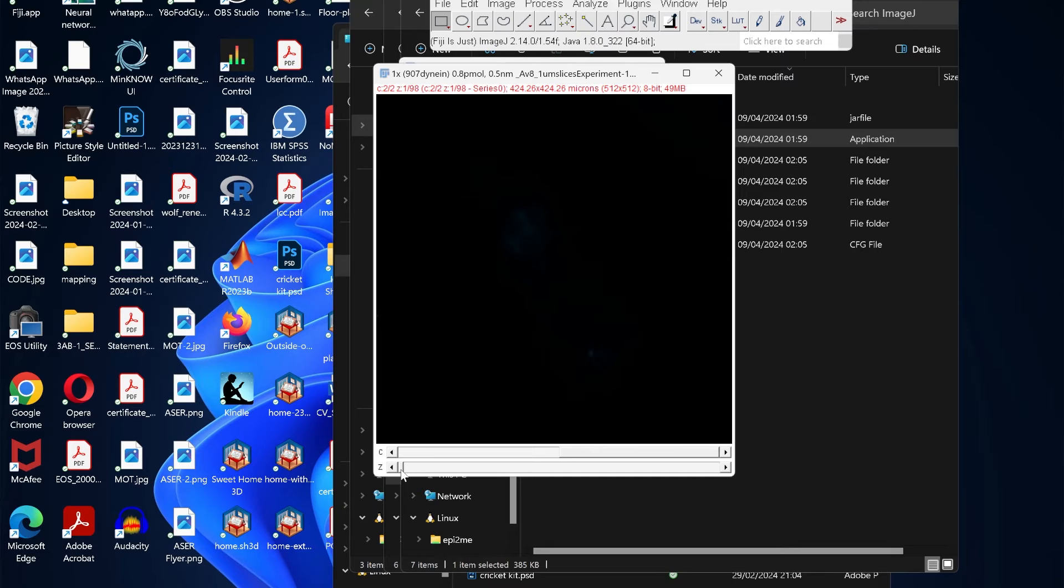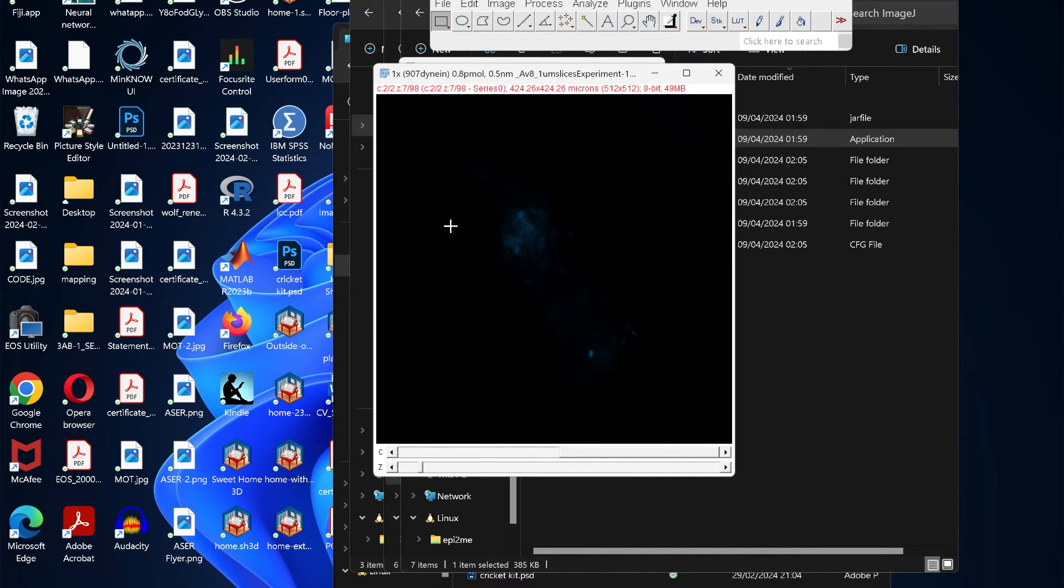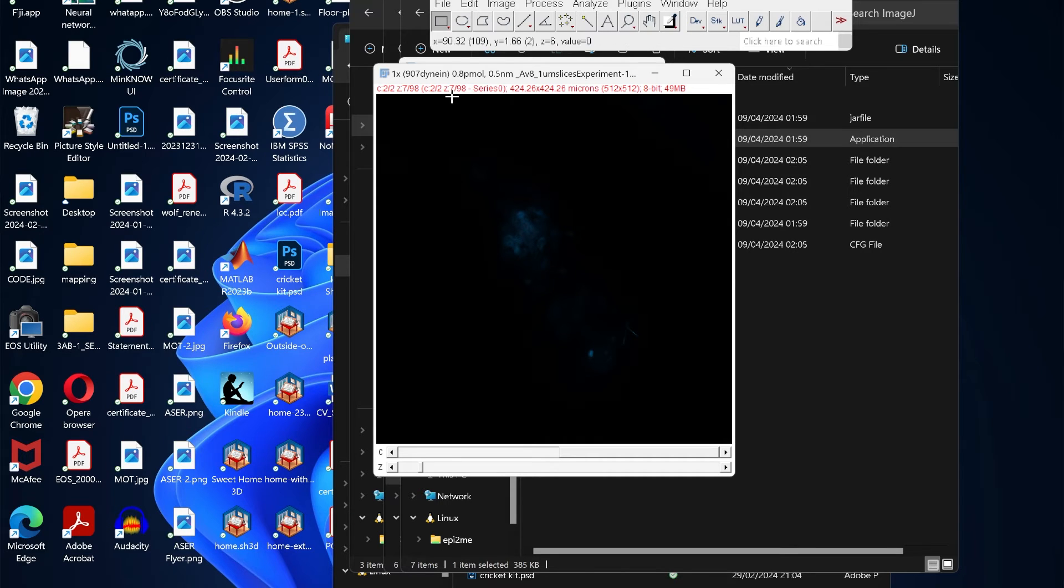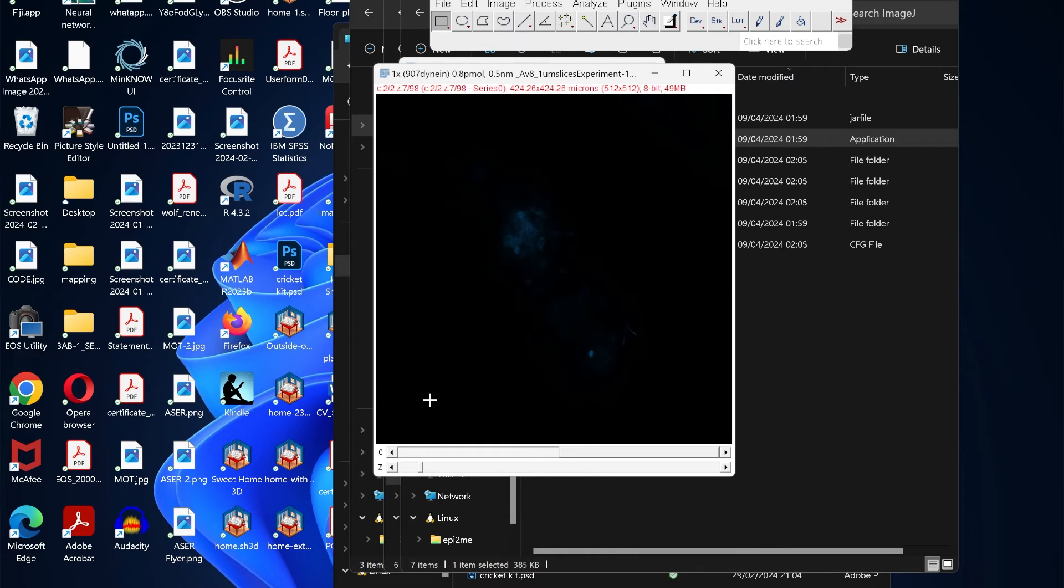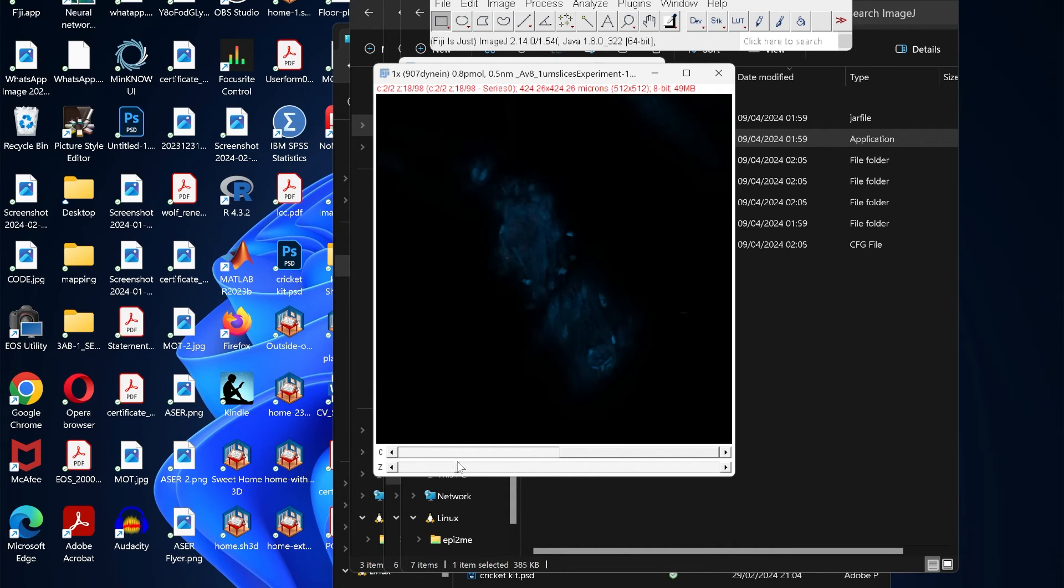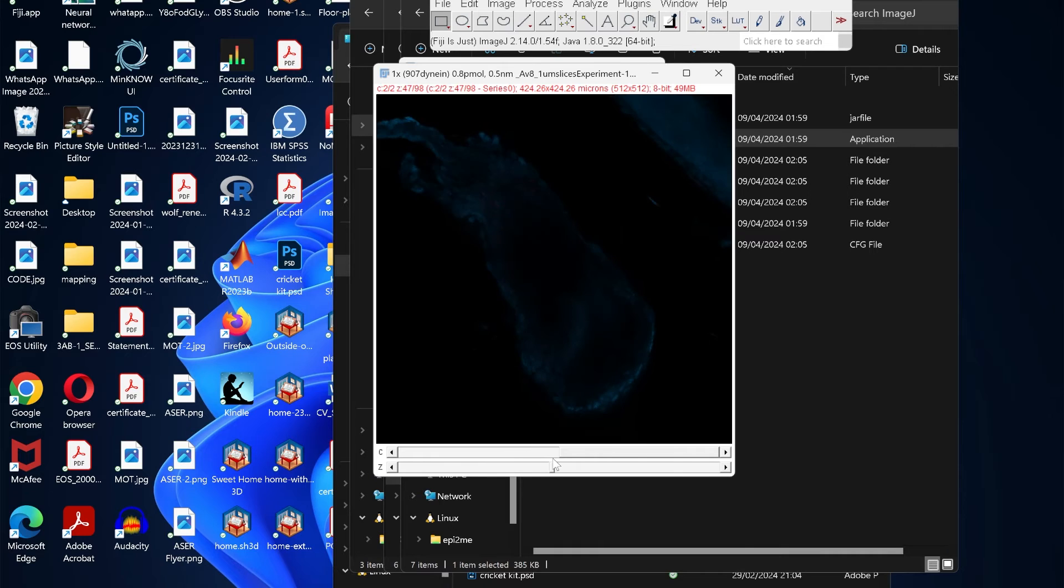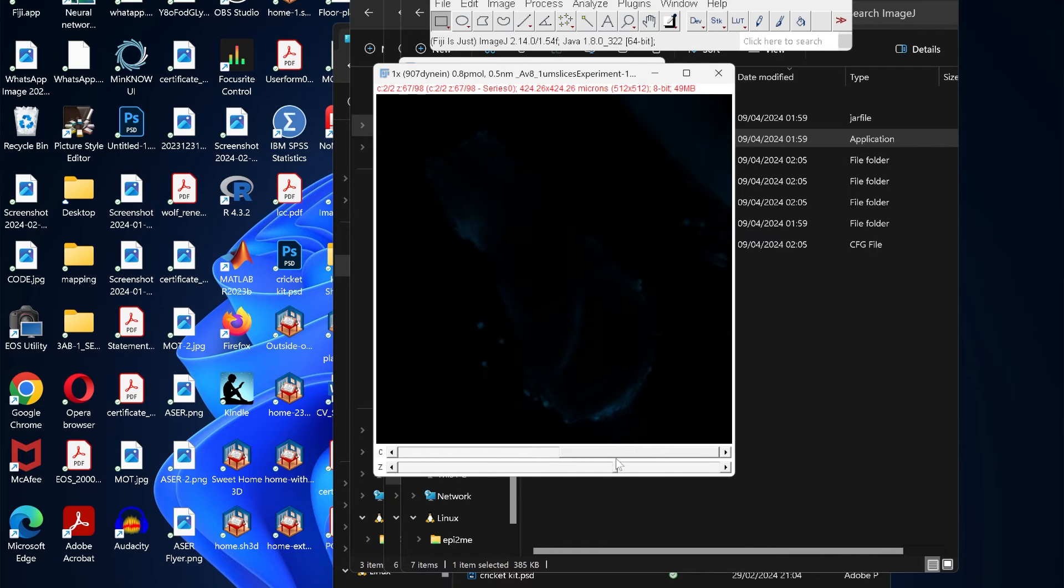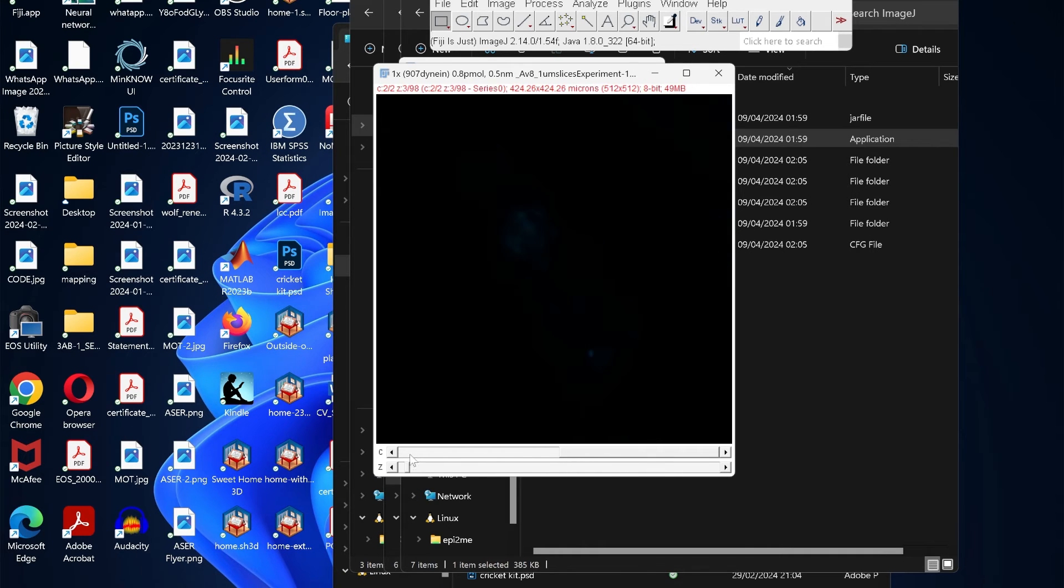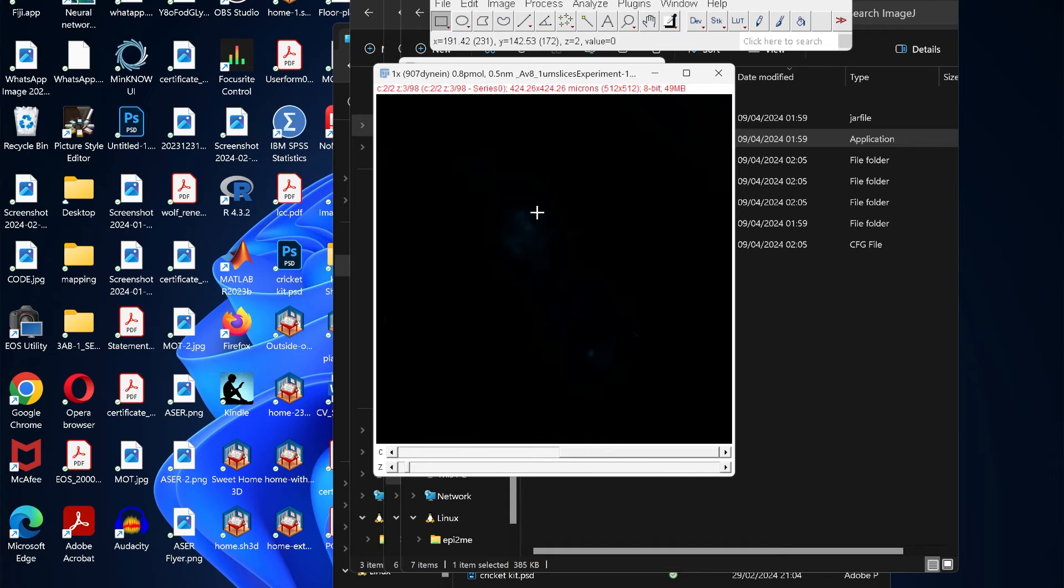If we move the channel bar to the right we see that it changes to channel two. The bottom one is the z-stack, so if we move it you see the information of the z-stack here also changes. Right now we are at slice number seven out of 98, so if we move it along we can see the different steps of the image.